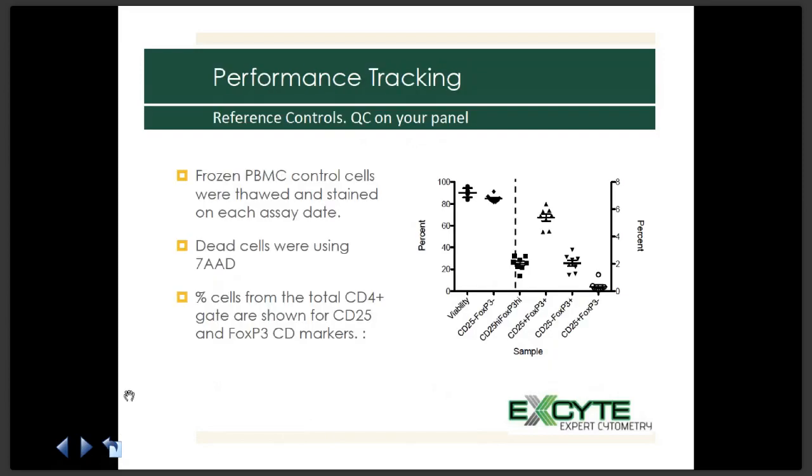Now, quality control is a really important topic. That's something that lets you know that the machine is working, something that people who are running your instruments, your core managers, facilities directors, are very passionate about and working very hard at. And that idea is that we track and know how the instrument is behaving every day, so that when you come into the facility, you know that it is behaving. And when we did QC, everything was well.